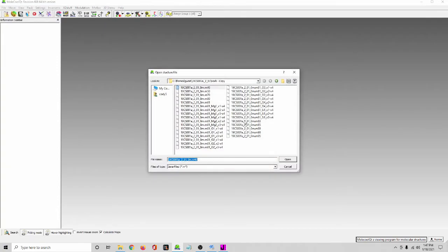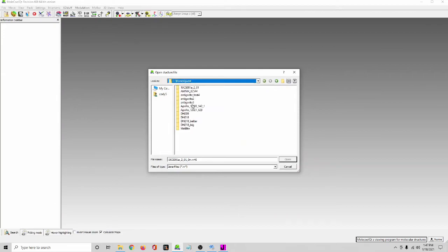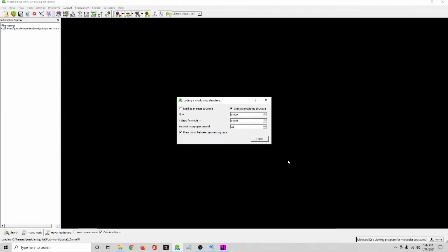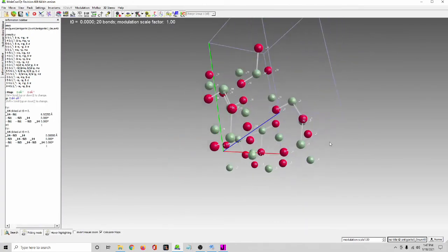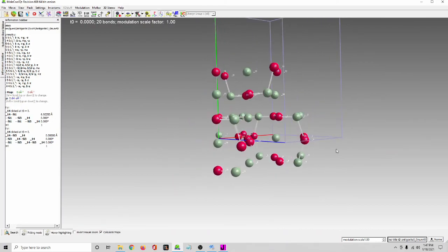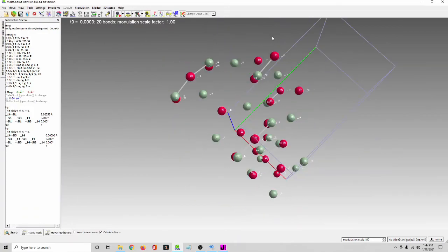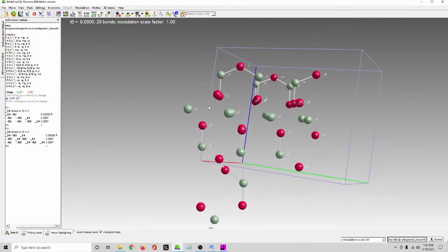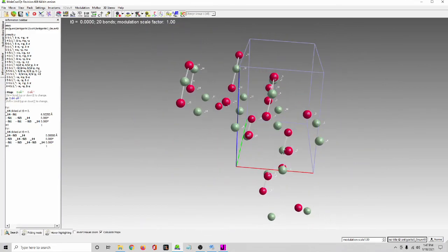But you can open it in this program, for example. We'll just see what our initial solution was. It's going to be silly, but we can open that. Yeah, so this is going to be wrong, but close enough to start with. Let's see. Oh god, okay, so we got the BA like this, okay.